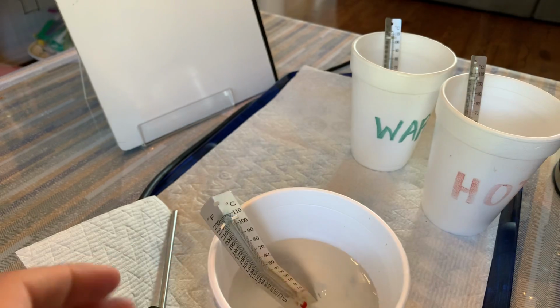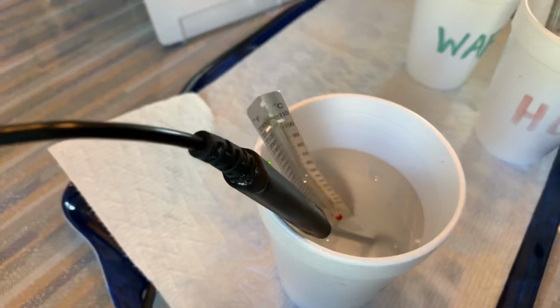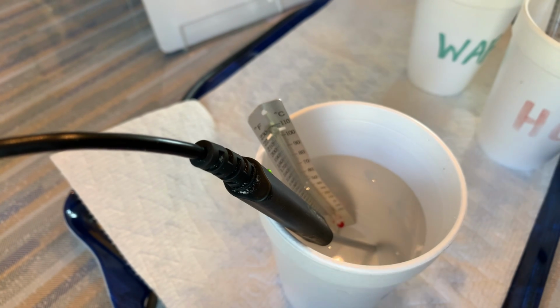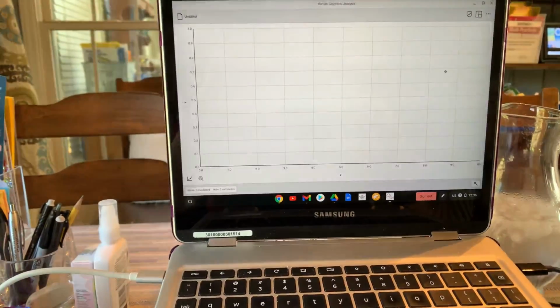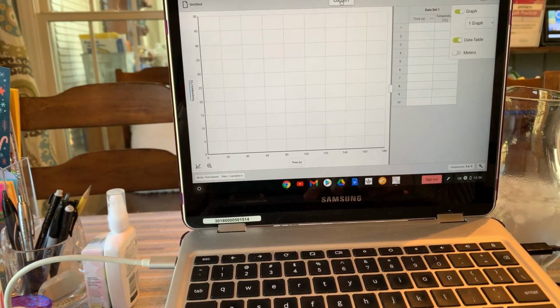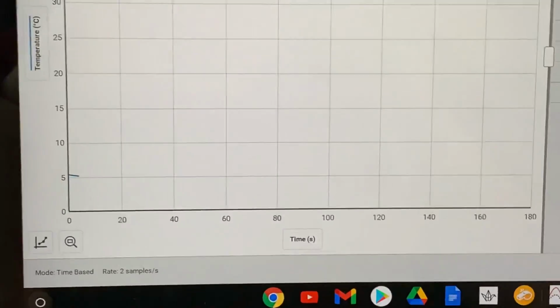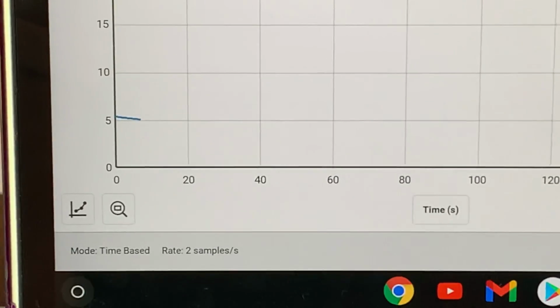So now I'm going to use my temp probe. I keep saying that wrong. And we're going to look at the graph again to see what the digital probe is telling us. Okay. So it's loading on my screen. I'm going to hit the data table and collect. Now, look at where the temperature is being recorded, way down here at the bottom of the screen.